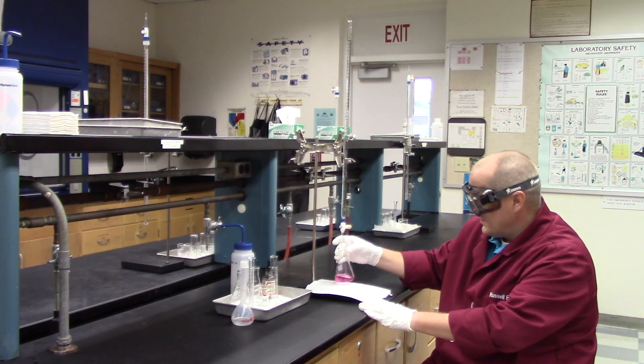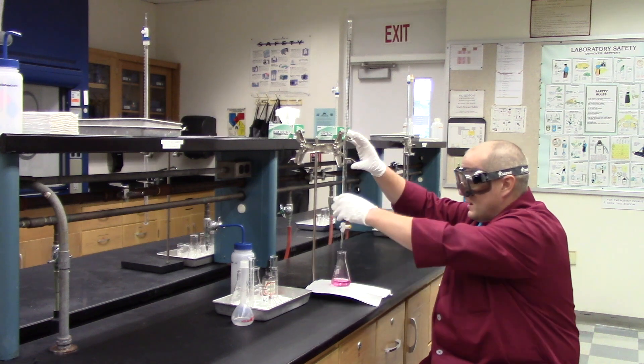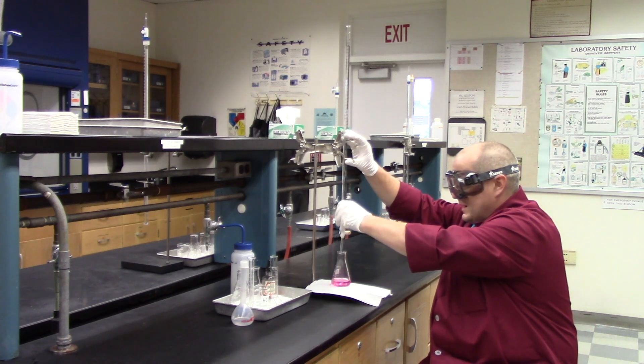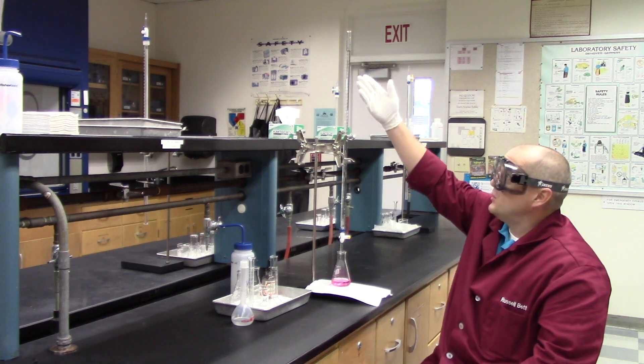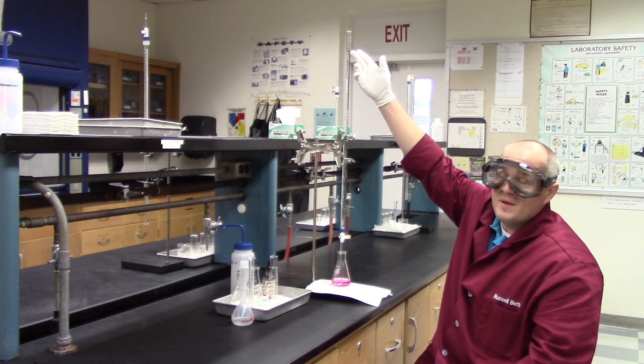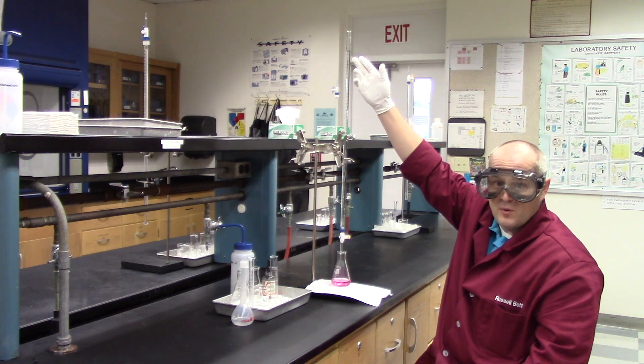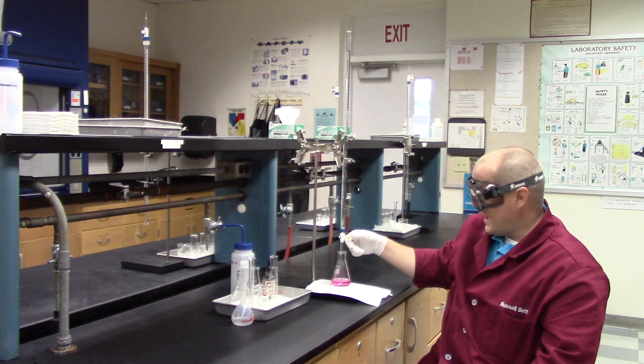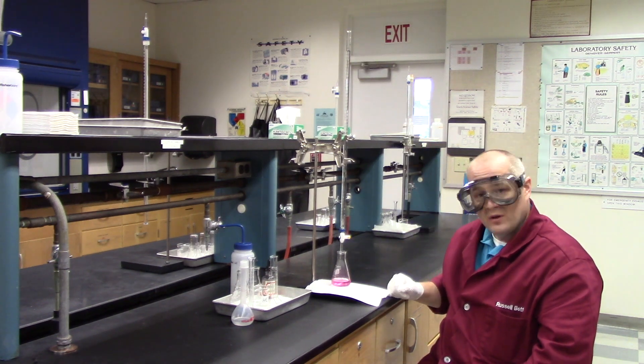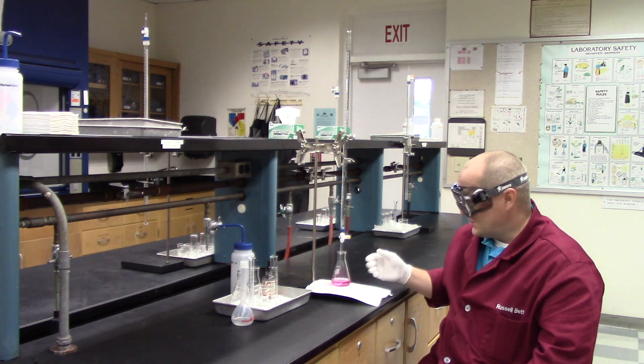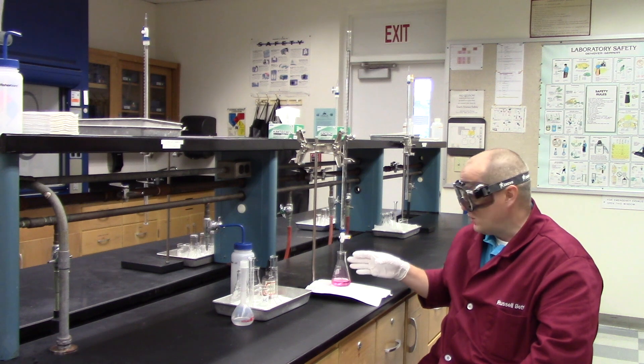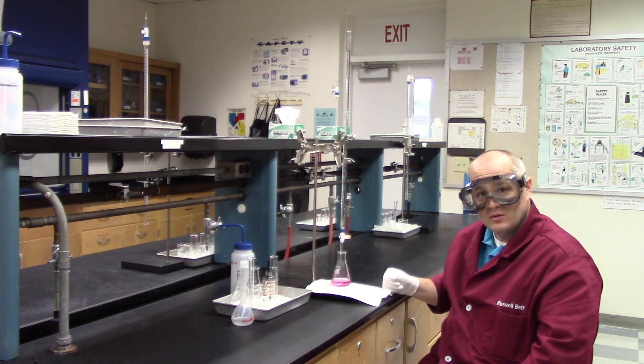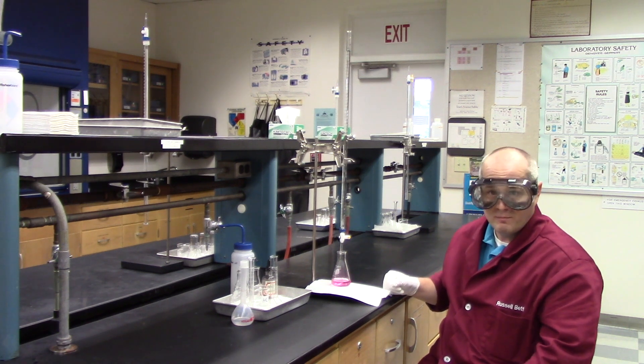Now place this under the burette, adjust the burette so that the tip is inside the flask, so that it minimizes splattering. Make sure you know where your meniscus is in your burette. Better if you start at 0.00. And then we're going to add base to the Erlenmeyer until the color changes to yellow. That will be the equivalence point, or the point at which the moles of acid equal the moles of HCO3 minus, or bicarbonate.